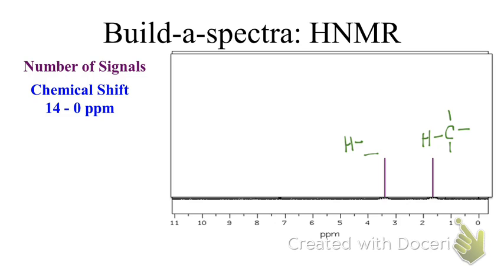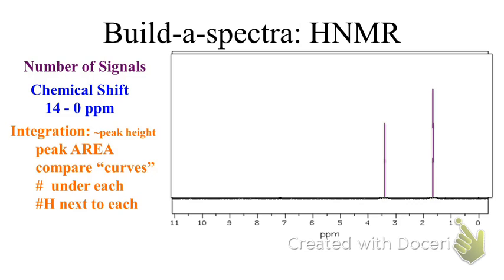What does our mass spec tell us? C2H5Br. Is there oxygen or nitrogen? No, which means that has to be a carbon. Okay? And I'm not going to draw in the extra bonds because I'm about to delete it all. Now we can take a look at the integration.